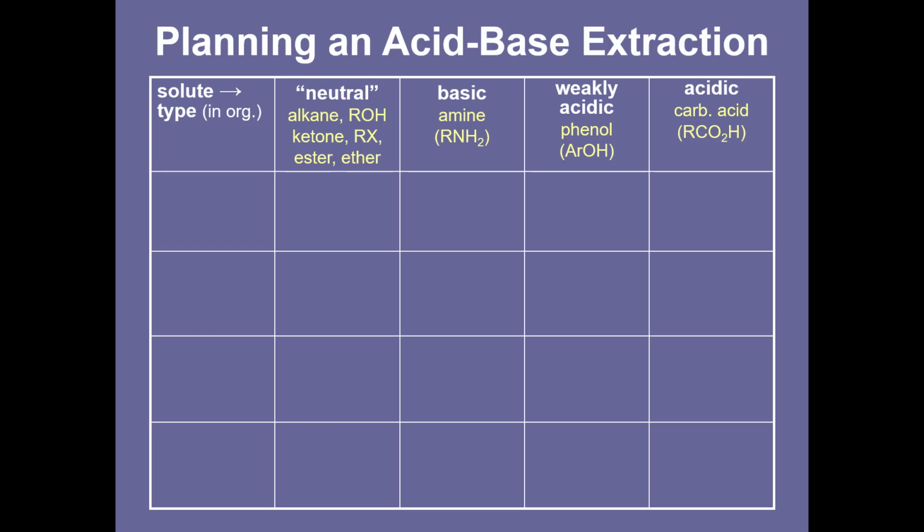Now let's take a look at the types of aqueous solutions that are available for extraction. One option is to wash the organic layer with neutral water. Now, keeping in mind that like dissolves like, we wouldn't expect any typical neutral organic compound to have significant solubility in water, so we would expect all the compounds listed to largely stay dissolved in the organic layer.